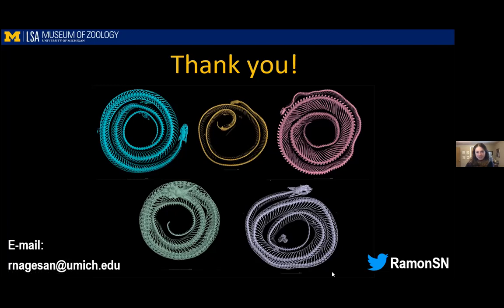Not yet. All right. Oh, what kind of voxel resolution are we getting? So the finest resolution I can get is about 5 microns, but it takes a bit of work to get a specimen scanned at that resolution. Most of my scans happen between 10 and 120 microns. The coarsest we can get is 121.62 microns.